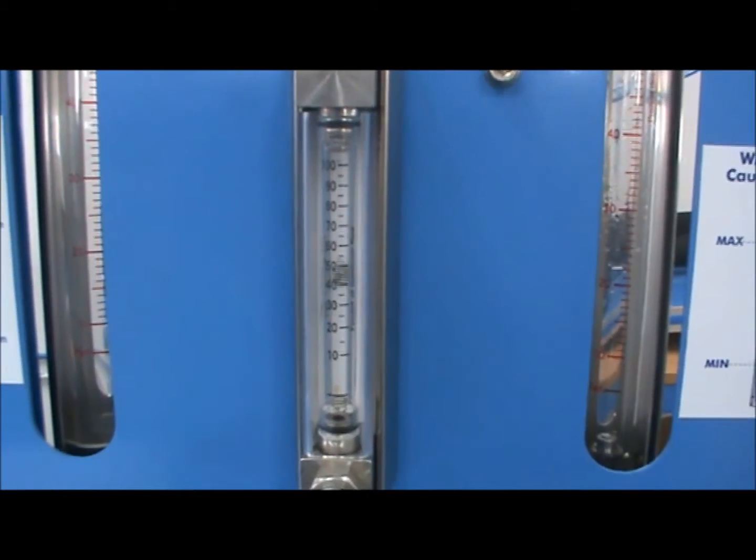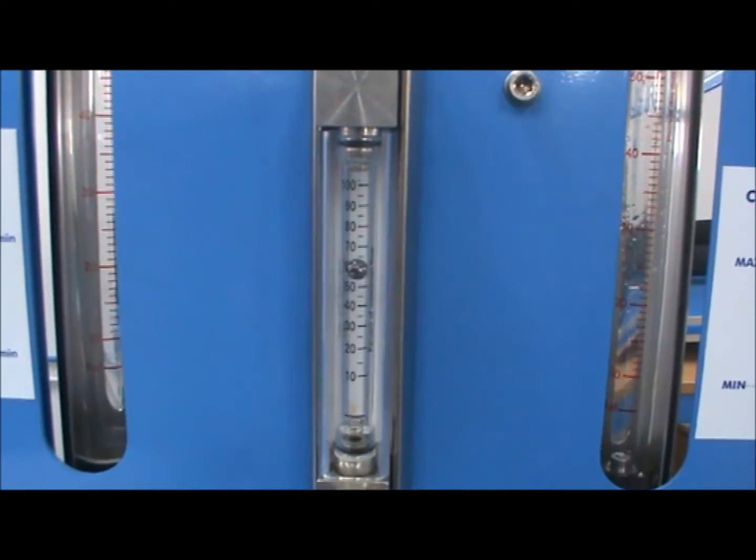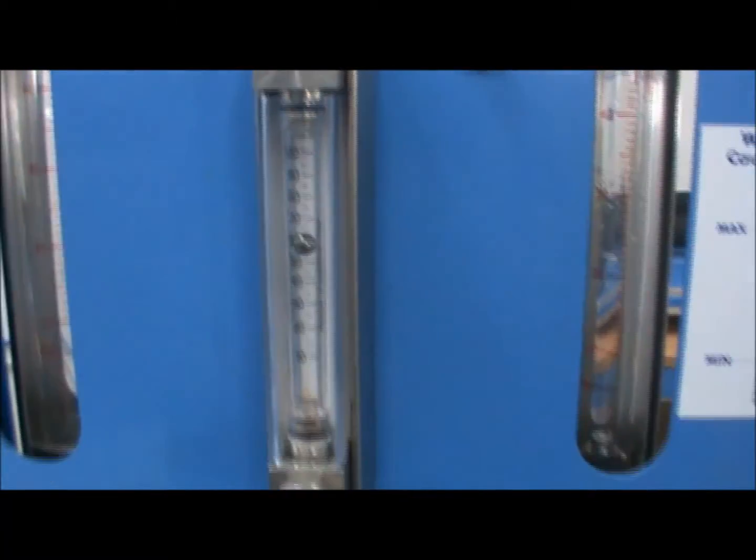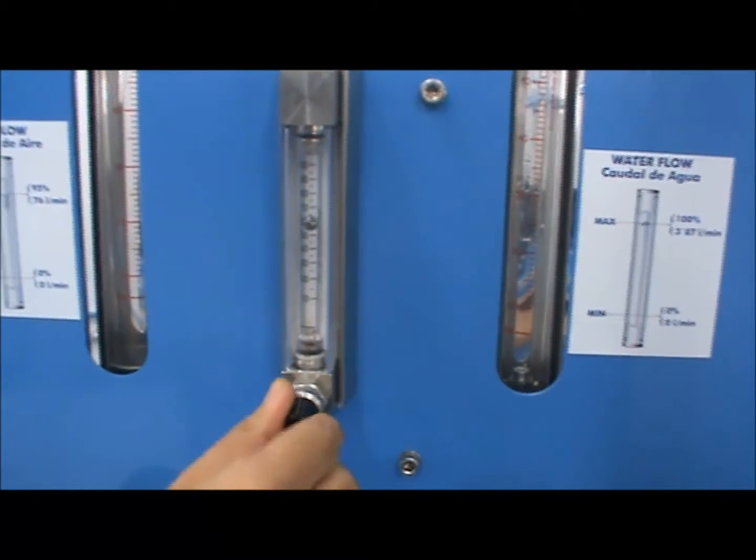Next, open the CO2 tank, providing one bar of pressure to the unit, and adjust the flow as needed. In this experiment, we will use 40%.